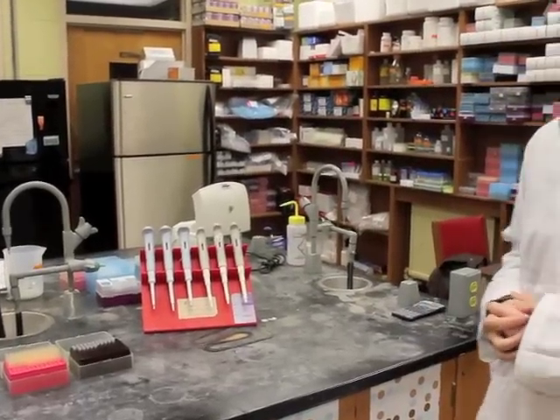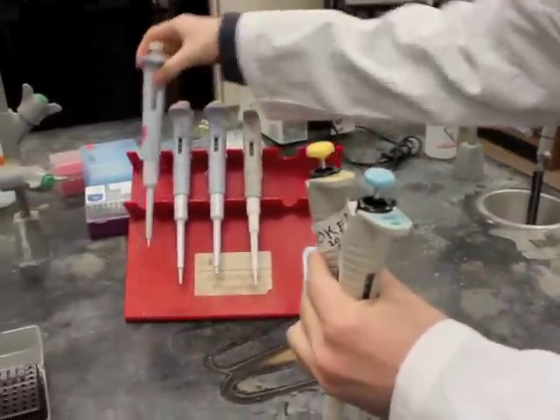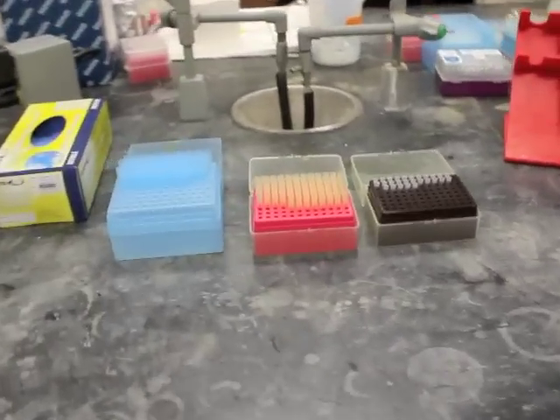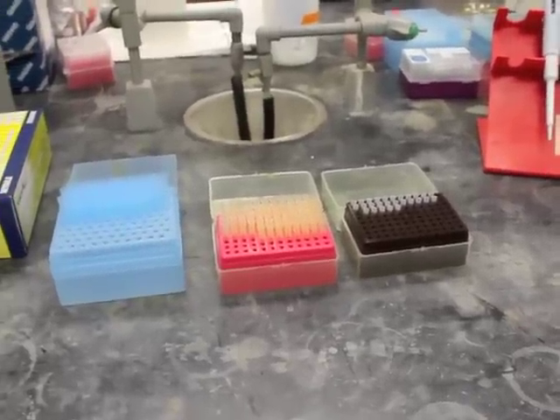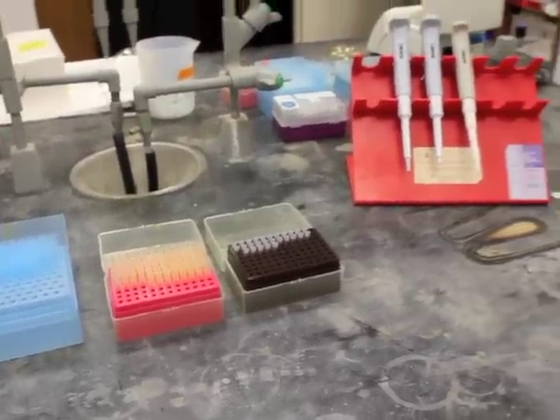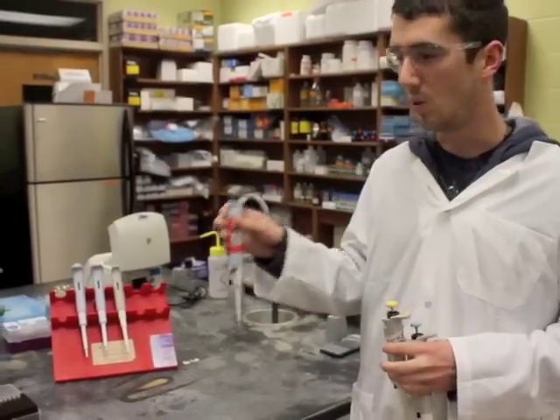Basically, what a micropipetter does is provide a very accurate way to measure extremely small quantities of volume. We have these different colored caps on the top of the micropipetters — there's blue, yellow, and white — and these colors correspond to the color tips that you'll be using with them. The blue tips measure up to a mil in volume, the yellow tips measure more popular quantities that are less than a mil, and the white tips are the smallest, which measure up to 10 microliters. Since our PCR reaction is only 10 microliters large, this is the only pipetter that we'll be using.